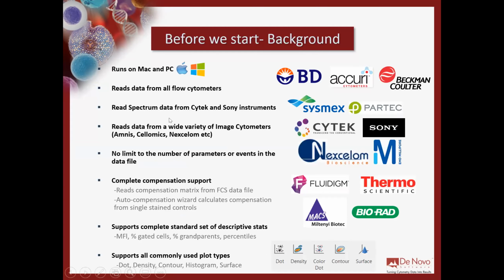Now, before we jump into the software, a little bit of background. FCS Express is going to run on your Mac. It's going to run on your PC with the site license at Sloan Kettering. One username, you can use that on any number of computers that you want.